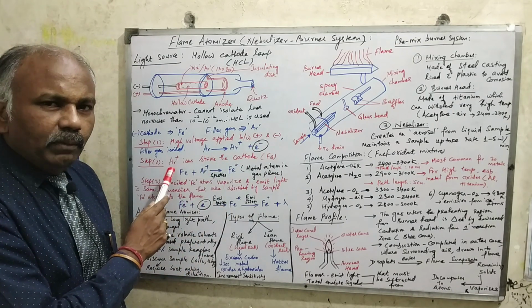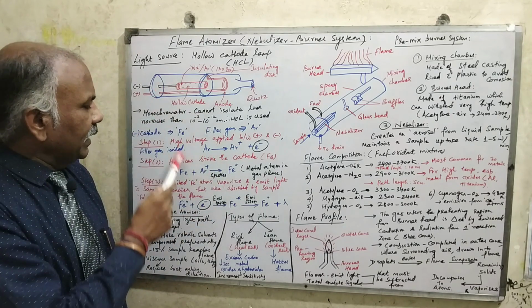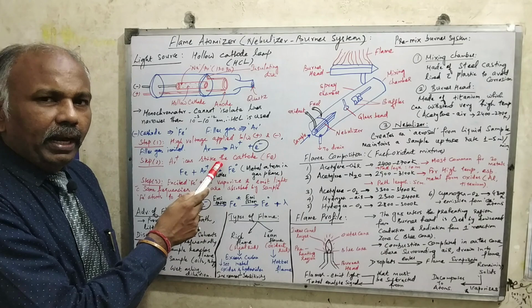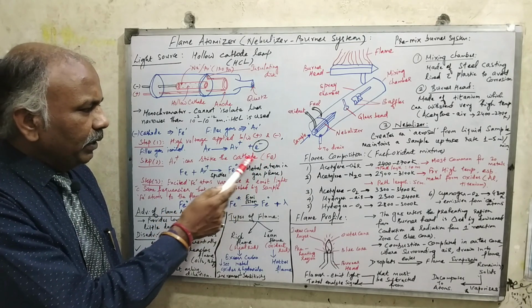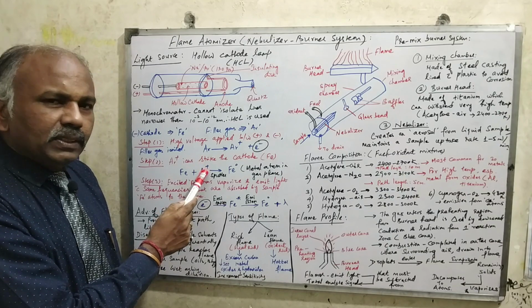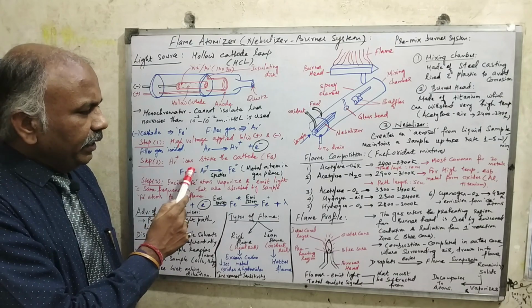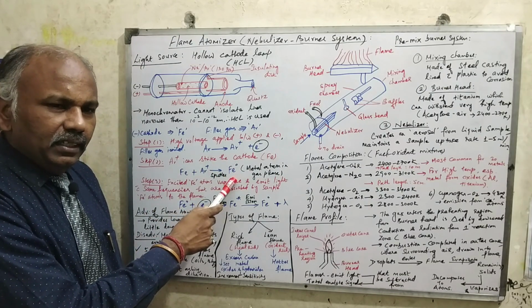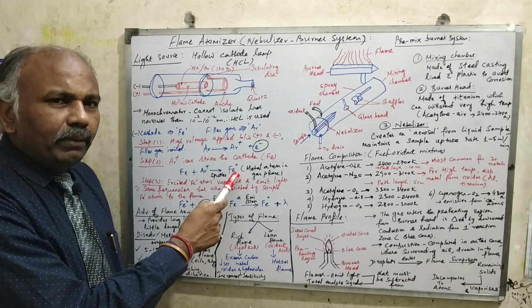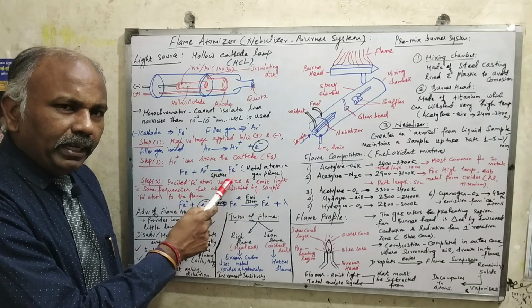Now in the second step, the positively charged argon ions will strike towards the cathodic terminal. They will be attracted towards the cathode. In the cathode, the iron element is present. So these argon ions will sputter the iron element as metal atoms in the gas phase. They will convert the iron into iron metal atoms in the gas phase. So the first mechanism is the sputtering mechanism.